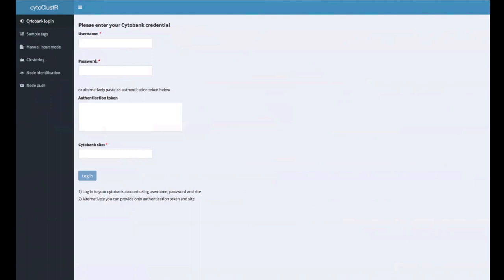You can load Cytocluster through R. There are mainly three steps in the workflow: first is retrieval of the data; second is selection of the main group — in this example we have three groups: healthy donors, responders, and non-responders; and third is node identification. Eventually, Cytocluster gives users the opportunity to push back the SPADE bubbles to Cytobank and observe them in the SPADE tree from within Cytobank.